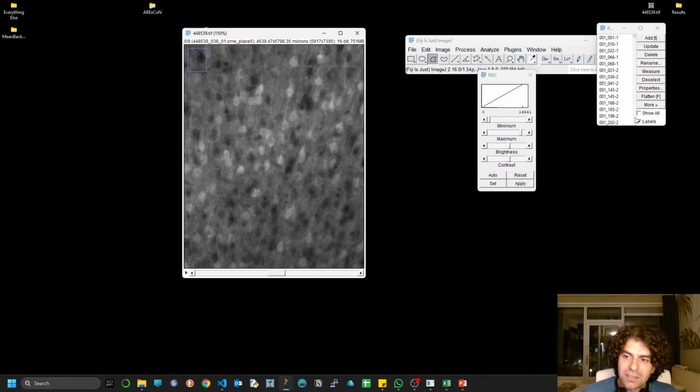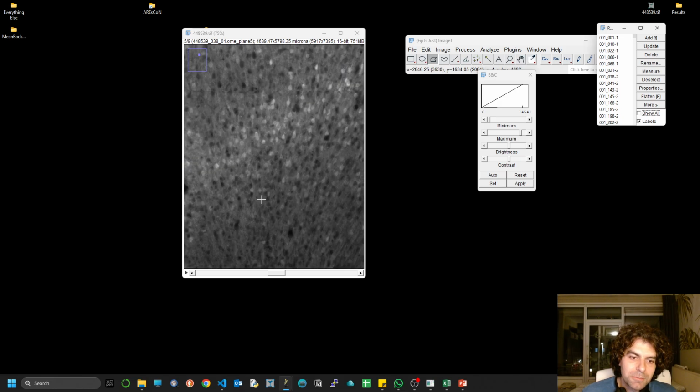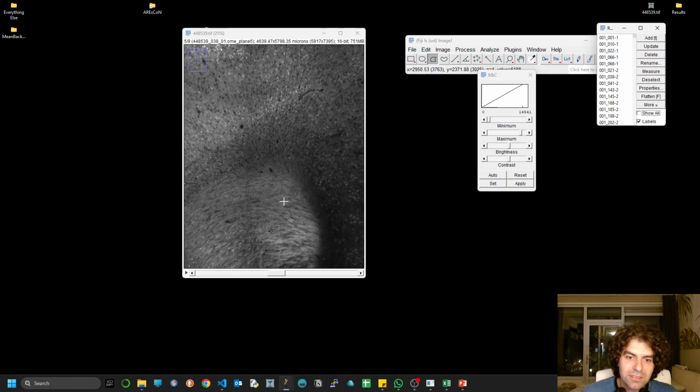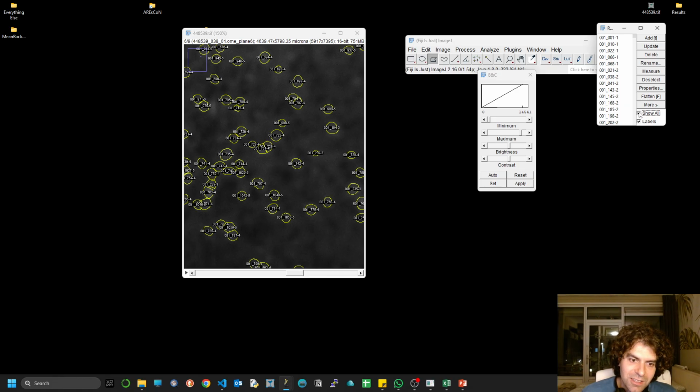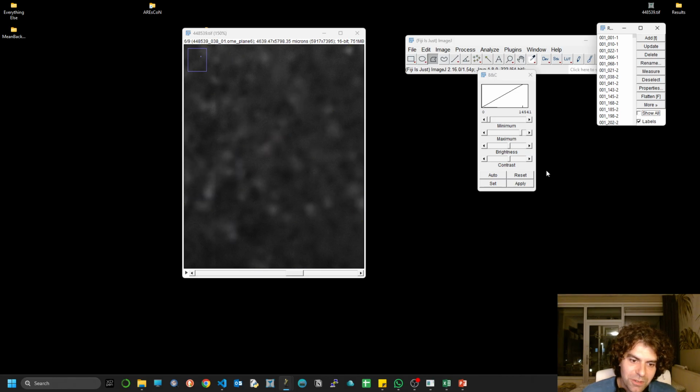This is clearly a test data sample, and it's just working beautifully, right? Let's go to a bit denser regions and see what the labels say. They say go between 3, 4, and 5, and indeed it's around 4, most of them, and you can see how beautiful the detections are.